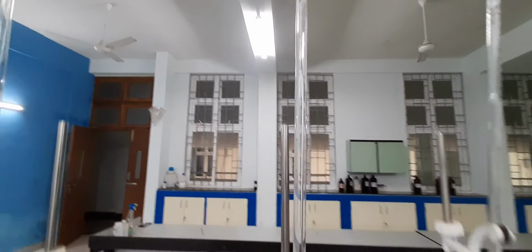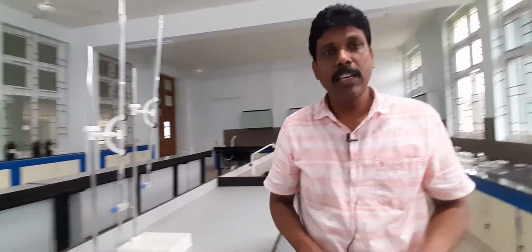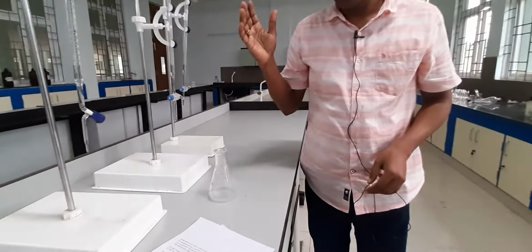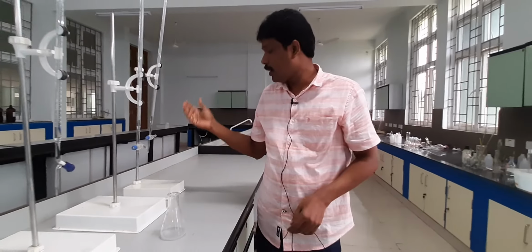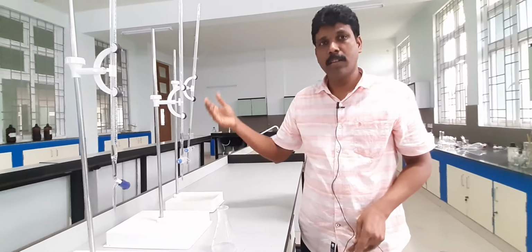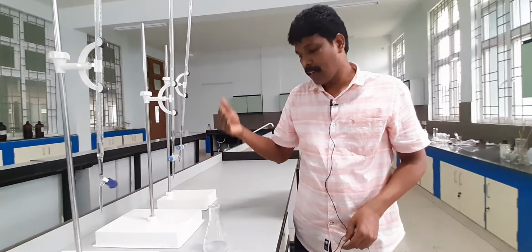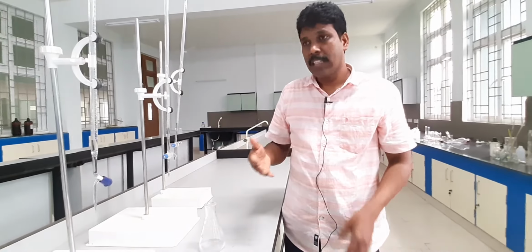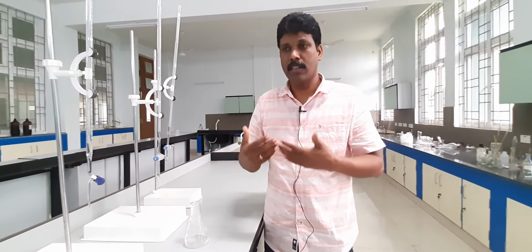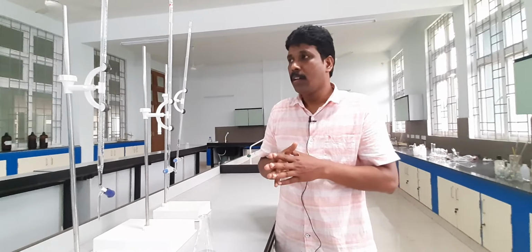This particular value is specific for the composition of acetic acid and chloroform, and if you change the composition, as you have seen, initially I have taken 10 ml of acetic acid and 10 ml of chloroform. Suppose I change this composition, the volume of the third component, the water, will be different. So that we have to experiment. In the experiment, this is what we generally instruct the students to do to collect the data. This is the way that normally you have to collect readings.